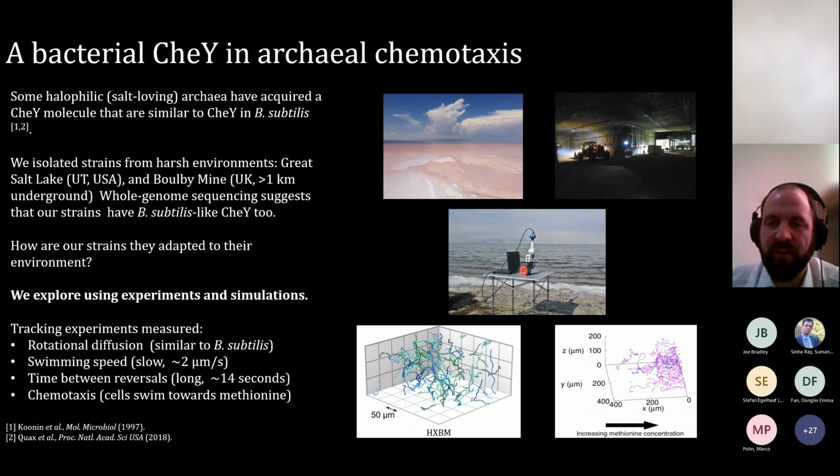So we have a cordless drill and a battery there that powers everything. We've got a nice table from REI, the outdoor store, and a little laptop there. And we're able to go and do some of these experiments outdoors. So it is a relatively unchallenging technique, experimentally speaking, as long as you get a couple of key ingredients right.